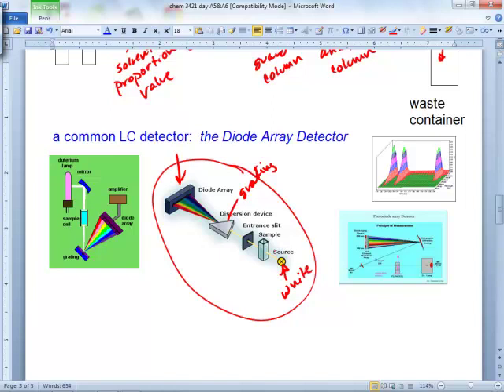So forget the sample for now. Just forget him for now. Right? You have this white light, goes through a grating, and then you see Roy G. Biv spread out on the diode. This photodiode array, a whole bunch of little solar cells. So the guy right here on the end, he's always red. The guy over here is always seeing blue and that sort of stuff.